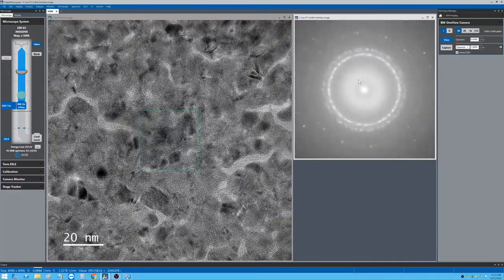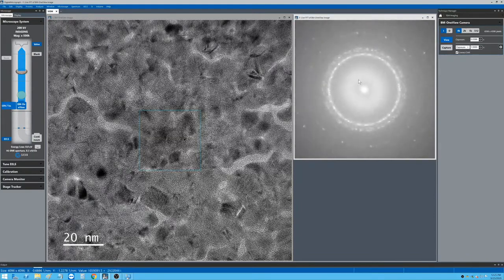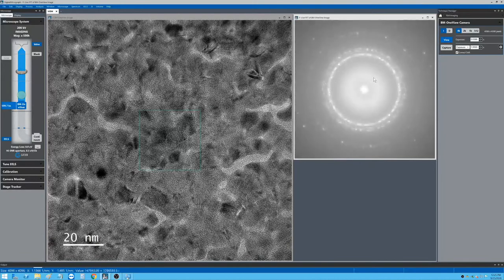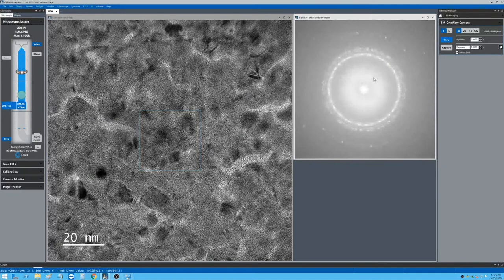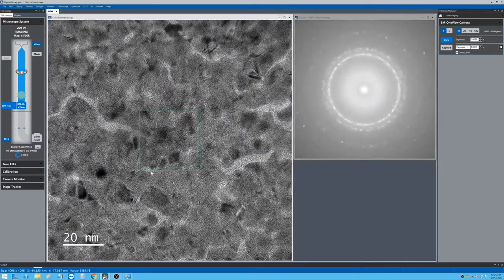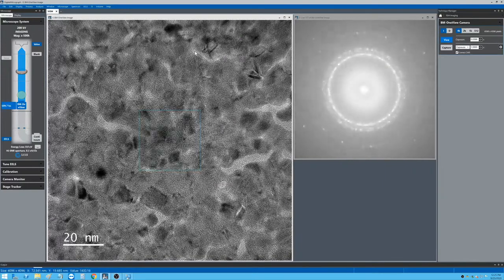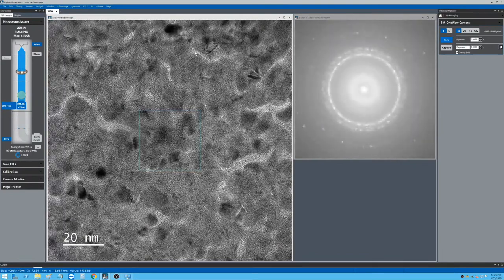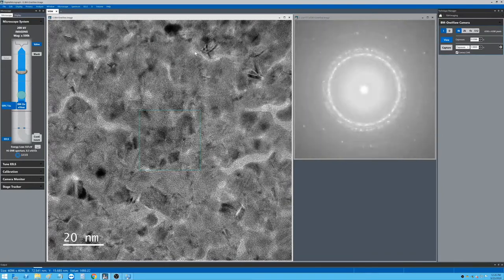To change the focus, this Fourier transform will tell you clearly where your in focus point is. It's just at the moment where you don't see the rings. However, if you come back to the image, at this moment you usually don't have a very good image showing up. You can see that your image is kind of fuzzy.